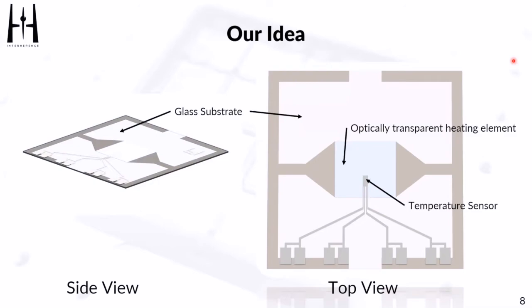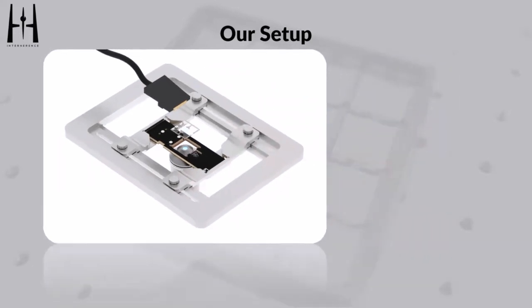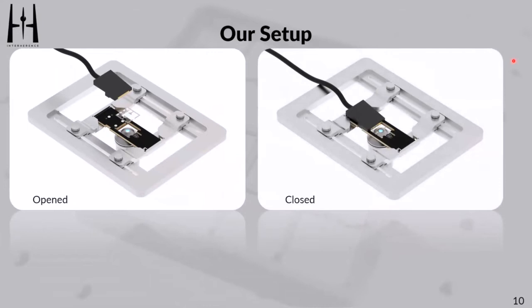And these substrates can be fit into a substrate holder, and this is shown here as a microscope adapter, which fits in all commercially available microscope slide holders for these thicker and elongated glass slides, such that this system is compatible in its closed form, where you want to measure, with all commercially available microscopes.